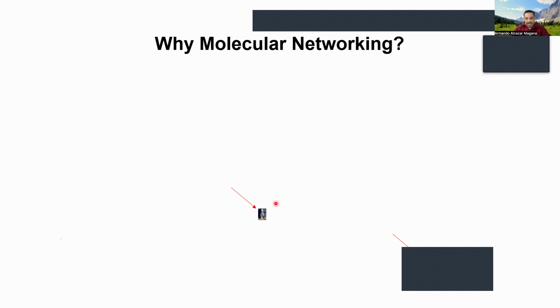So I want to ask you if anyone can guess what this object is here, and this one here. Let's imagine these are individual molecules. And sometimes what the mass spec sees, it will not know what it is, but if we know what is around them, then we can get a better guess.